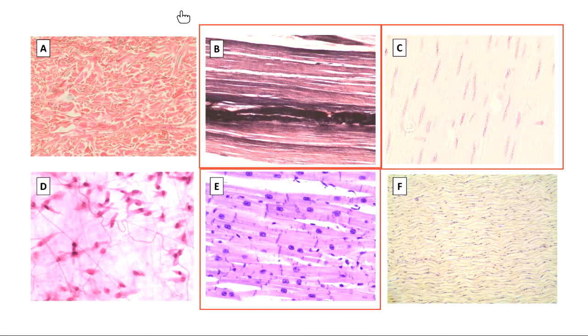Which kind of muscle tissue do I see on this slide? Can we tell? What kind of muscle tissue is this one? Yeah, this is an example of skeletal muscle tissue. The way you're going to identify skeletal muscle tissue, check out those striations. I'll zoom in just so you can see it up close. Hopefully you've looked at these a lot in the guided lesson. These alternating dark and light lines inside this tissue mean it is a striated muscle tissue.